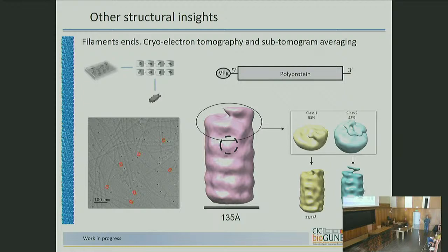Of course, we did classification using more classes because you may have broken filaments and you are not aware. At the same time, I have to say that we prepared those samples for tomography the same day as the purification. We just prepared viruses without storing them anywhere, and made the grids, trying to improve the number of real ends in the sample. And when you do classification, it doesn't look like there is anything capping. It's like the helix has a stop at some point, and that's it.